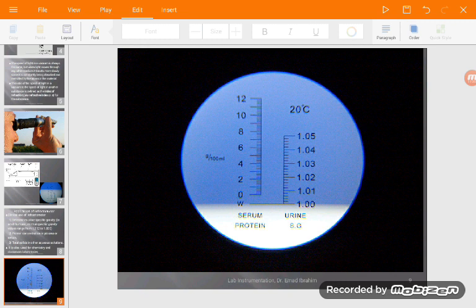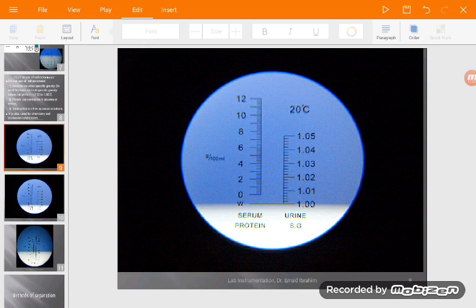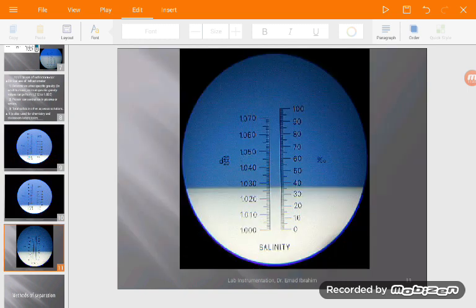This is the urine specific gravity scale. The right-hand scale shows the percentage, and the left-hand side is the urine specific gravity or specific gravity of liquids. We can read it here as about 1.027.